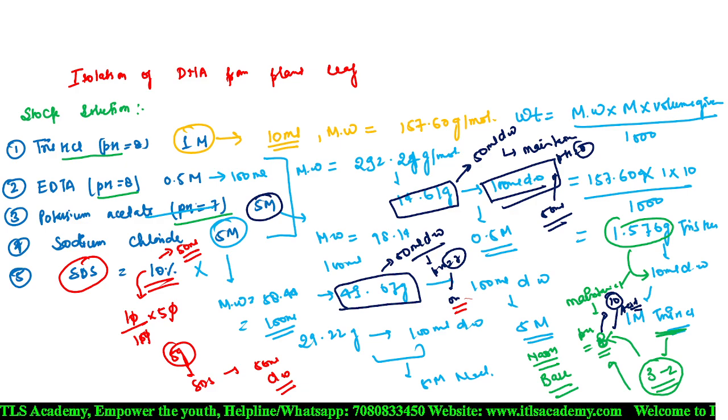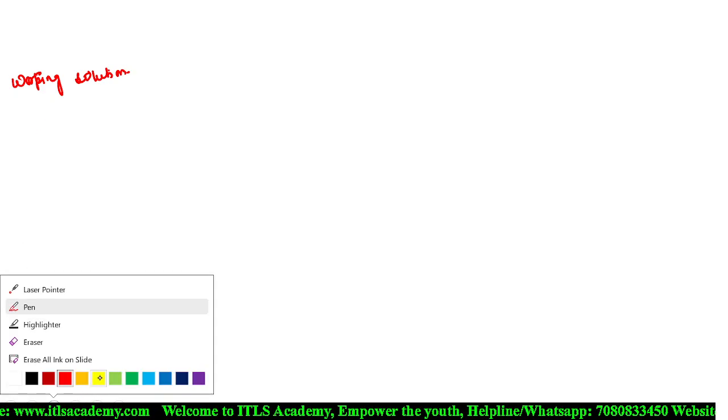Now, after the preparation of this stock solution, you have to prepare the working solution with the help of the stock. Now, the next is the preparation of the working solution. So, the solution that you prepare is the extraction buffer.